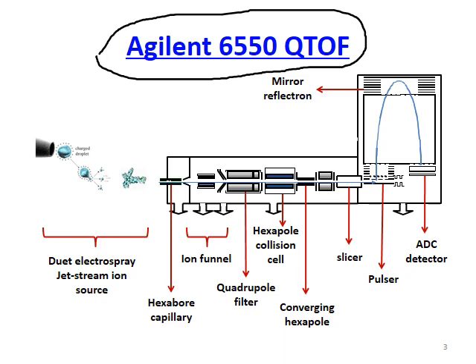As you already know, a mass spectrometer detects charged ions, so the whole design of the instrument is meant to firstly generate ions, followed by ion transmission, and finally ions being detected.